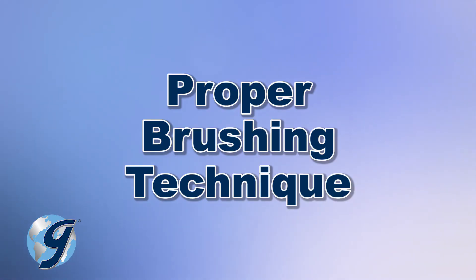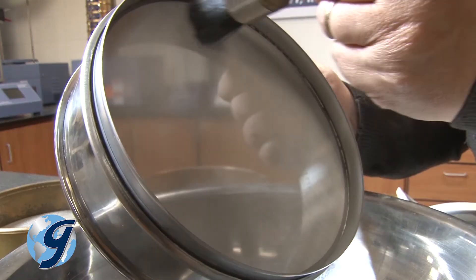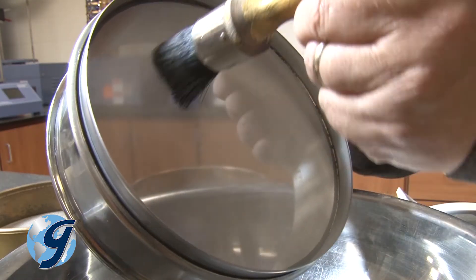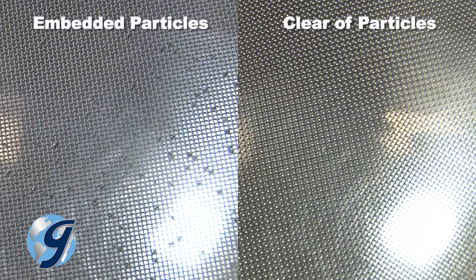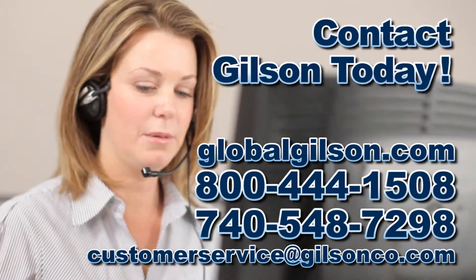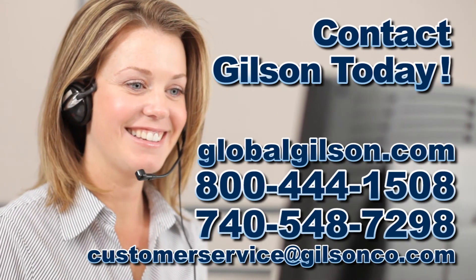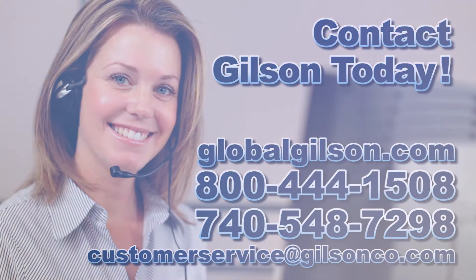Be sure to use proper technique in brushing mesh. Brush the underside of the wire cloth in a circular motion, exerting light pressure to dislodge near-sized particles. Examine your sieves frequently. And for any questions concerning your test sieves or for any Gilson product, please contact the Gilson Technical Support Team.